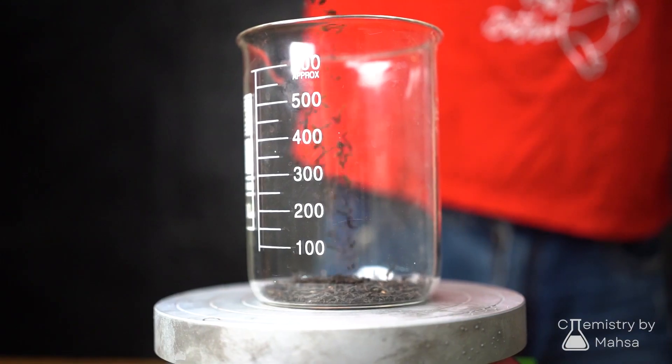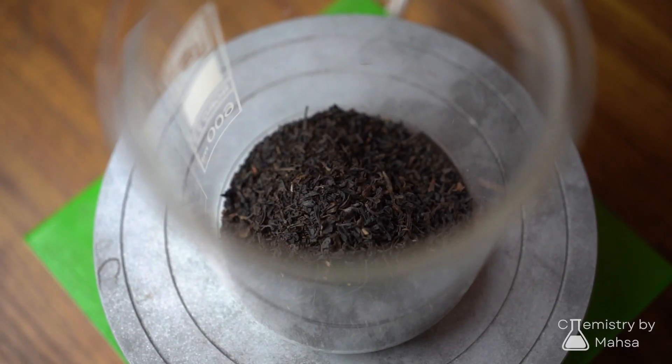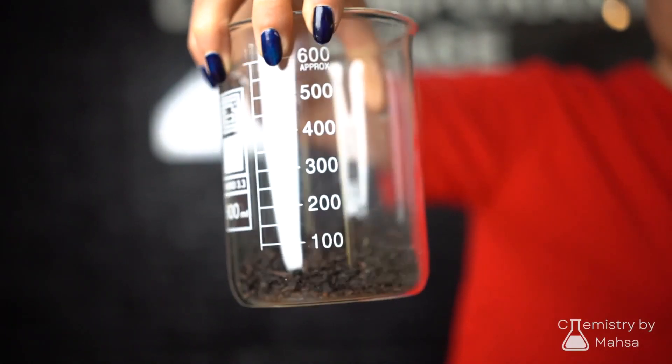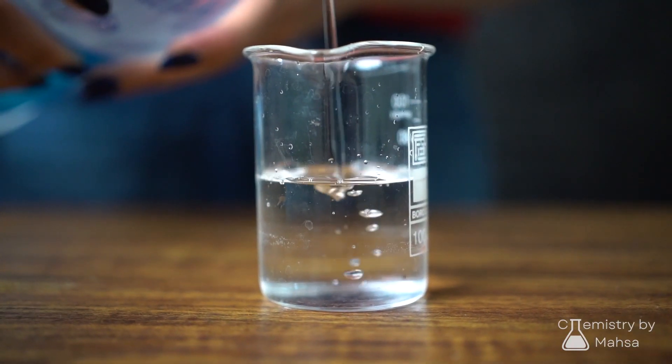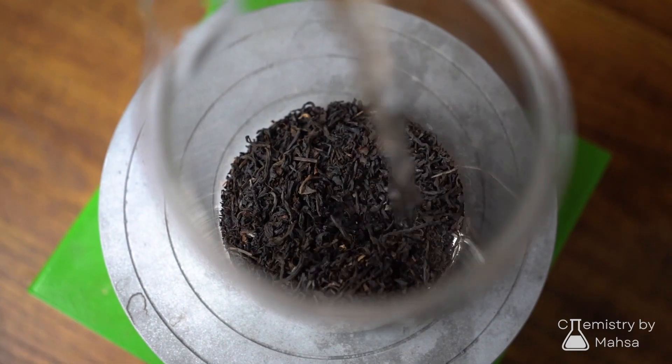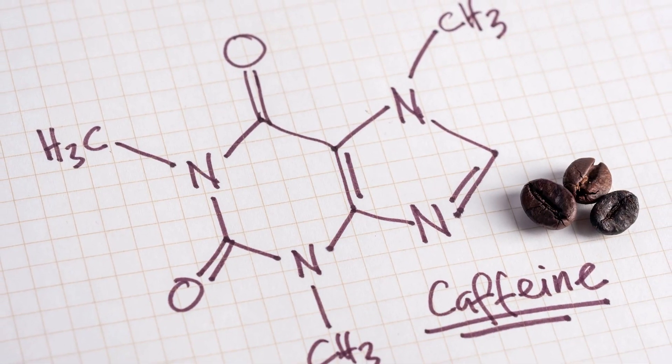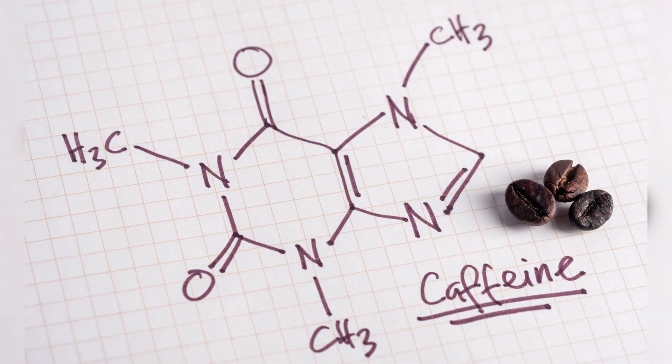In a well-equipped lab, you can eliminate the first step and directly soak the tea in DCM. To begin the process, 10 grams of tea leaves were boiled in 90 milliliters of water. I could simply just soak them, but higher temperature increases kinetic energy, allowing water molecules to penetrate the tea leaves and interact with the caffeine.